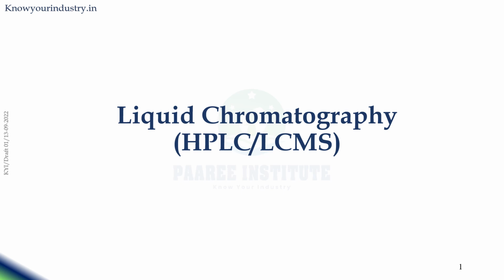Hello aspirants. In this module, we are going to see liquid chromatography. Liquid chromatography is one of the chromatographic techniques which we have seen already in the previous module. And liquid chromatography is the most adopted chromatographic technique in the industry.